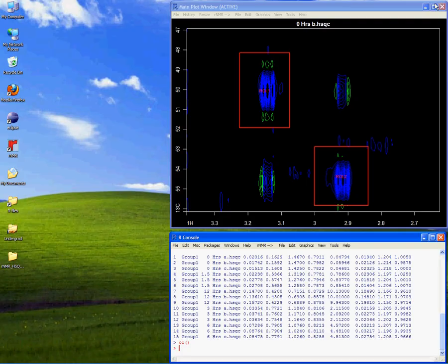As useful as the ROI feature is, it cannot stand on its own. With this in mind, RNMR includes a full feature set and an intuitive interface designed for easy access.